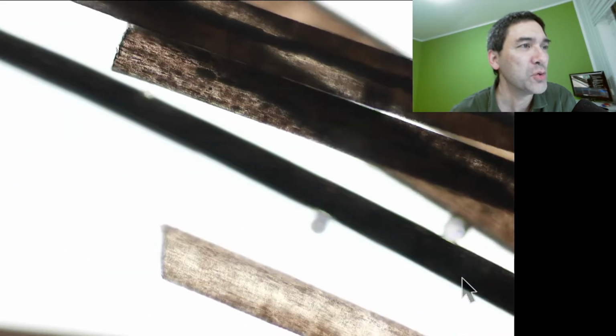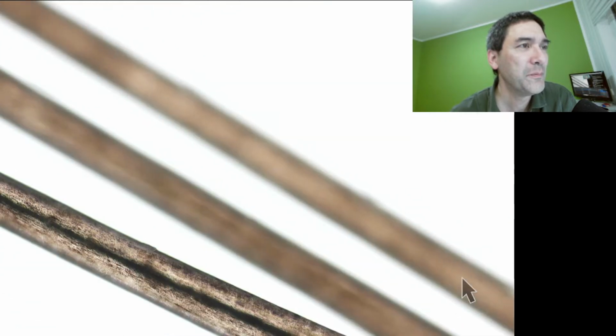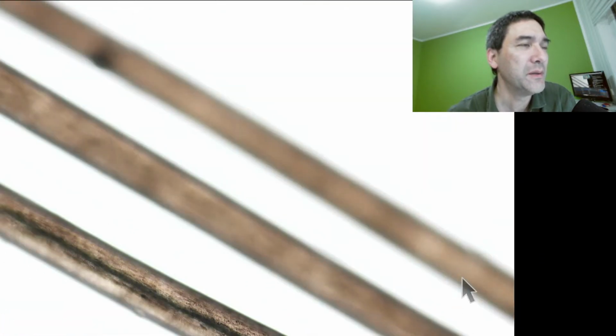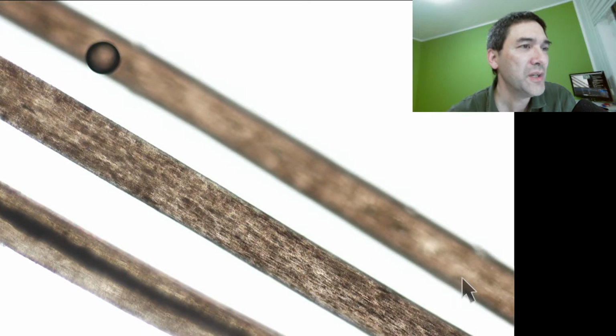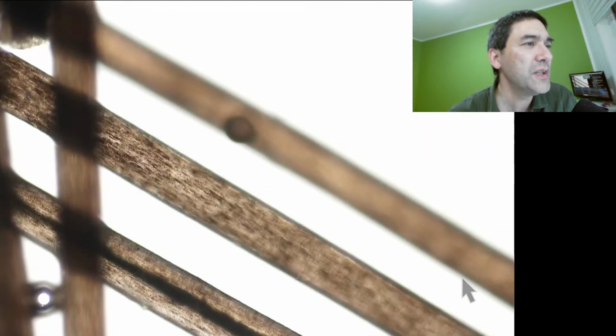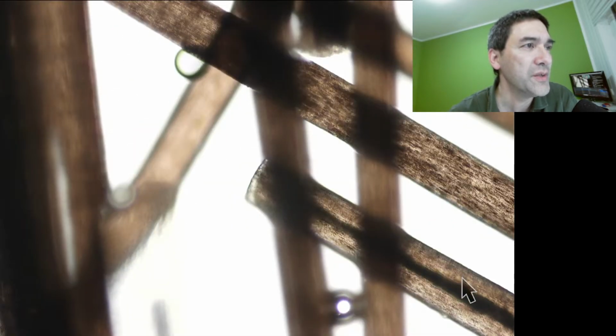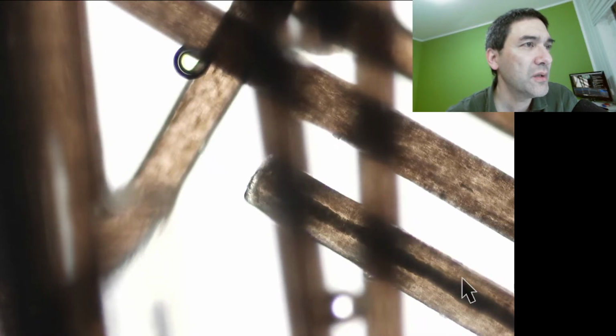That's basically what's happening right now. It will absorb the water and expand a little bit. By the way, you can use this also as a way to measure moisture. It's kind of interesting. Not all of them have this central canal here, for whatever reason. It's kind of interesting.